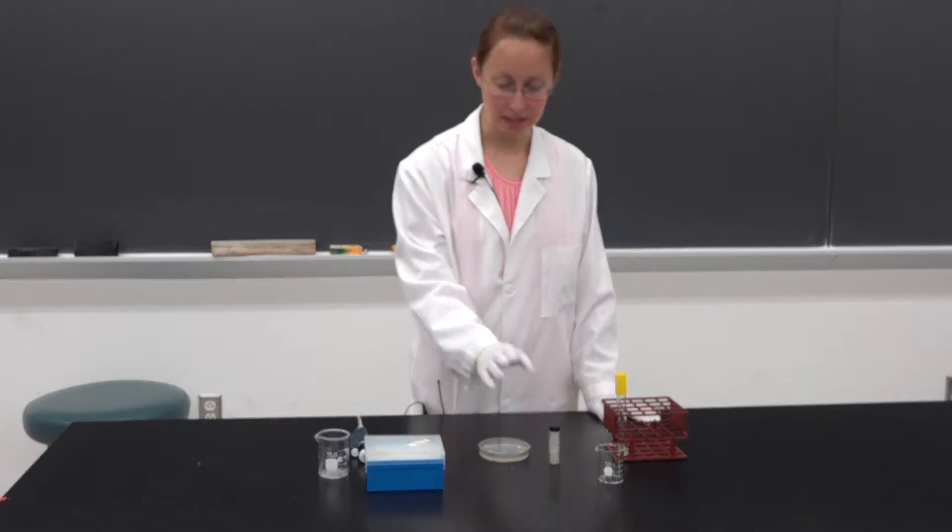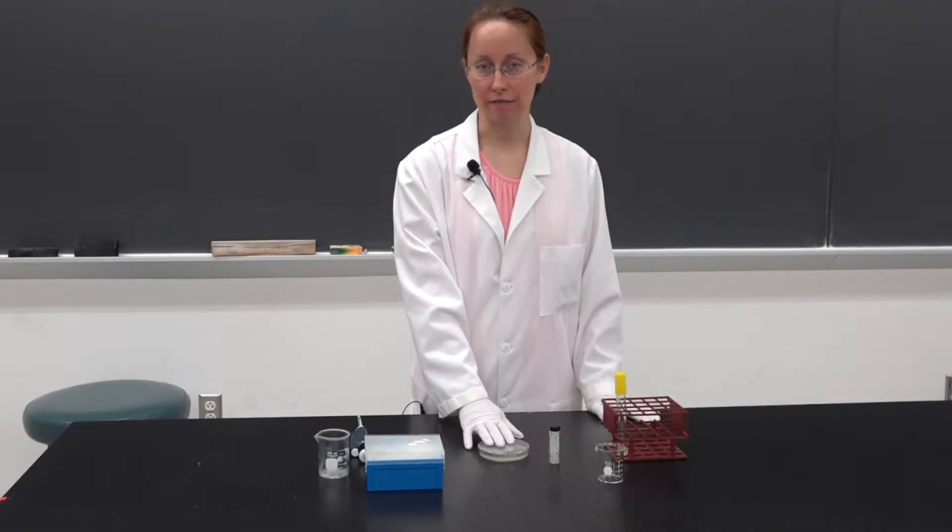I'm going to demonstrate how to use sterile glass beads to spread bacteria evenly over the surface of a petri dish.